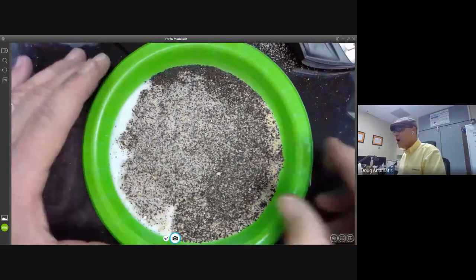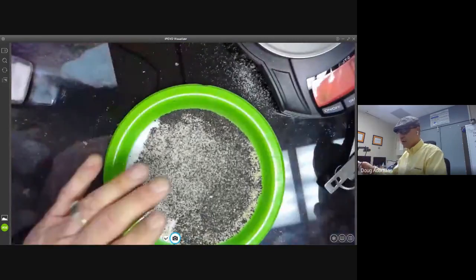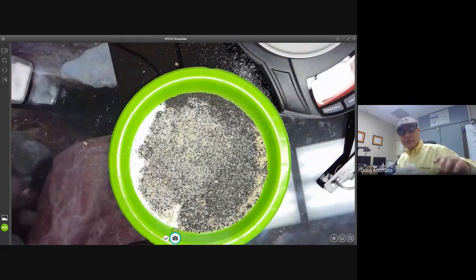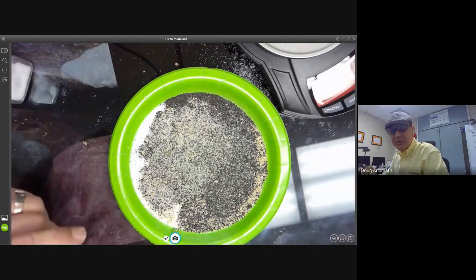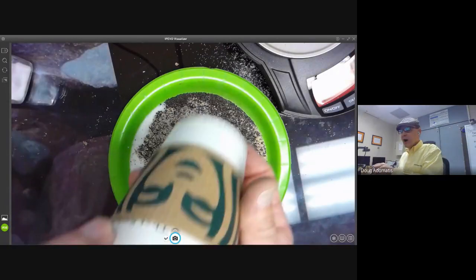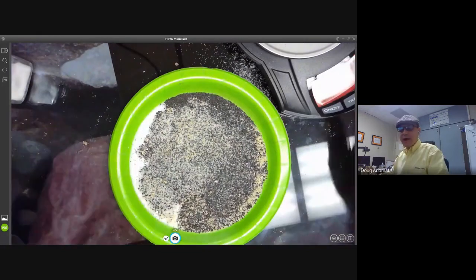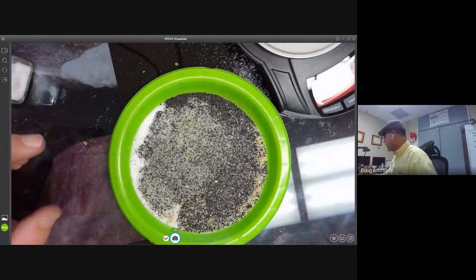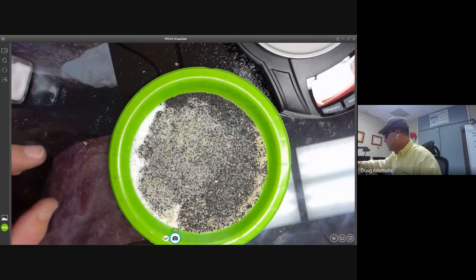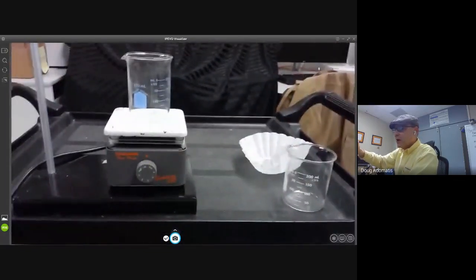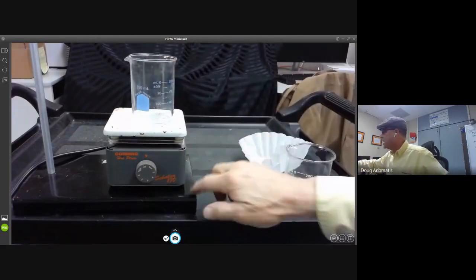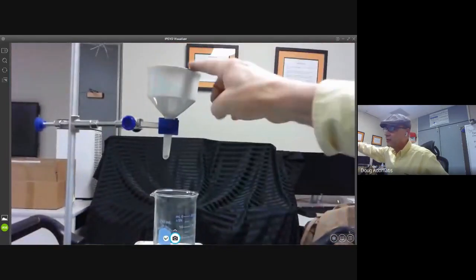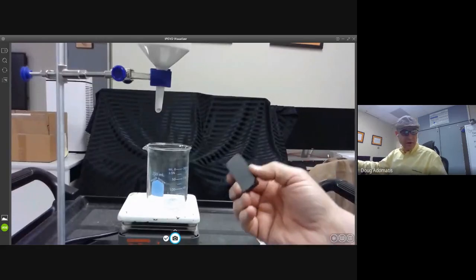Five dollars — a five-dollar Starbucks gift card — for the first student who can separate those three things back to their known quantities. To make it easy for you, here's what I've got: a beaker, a hot plate, a ring stand with a funnel, and a magnet. I'll give you the magnet back.